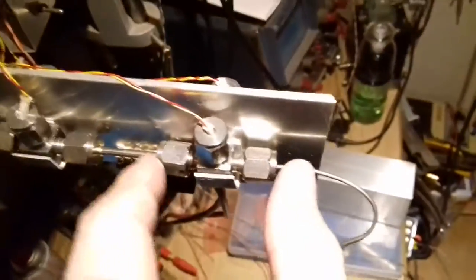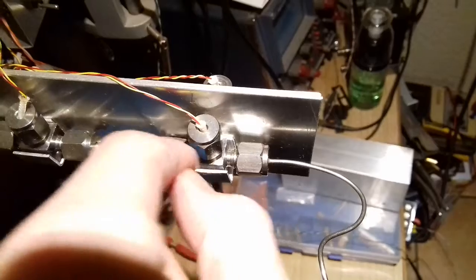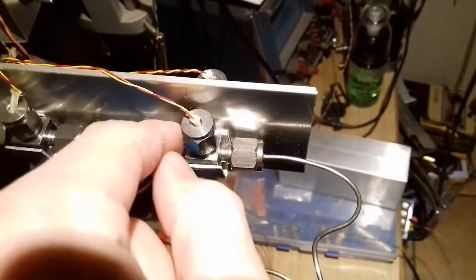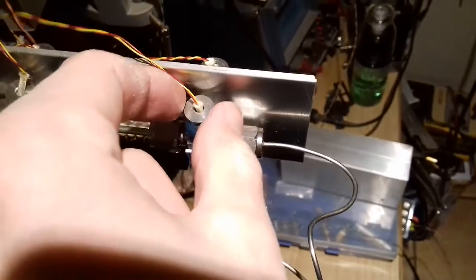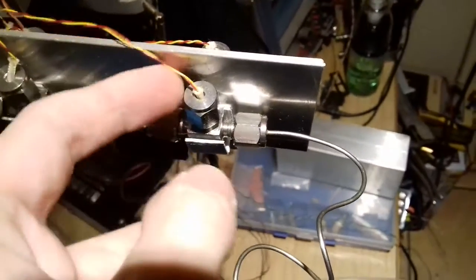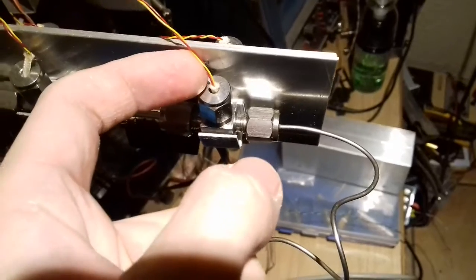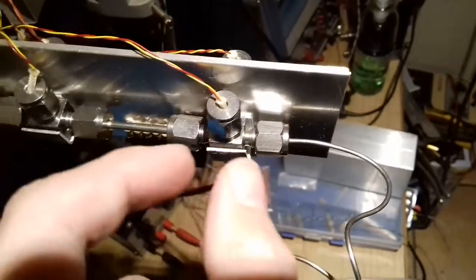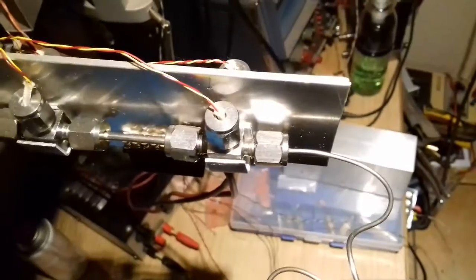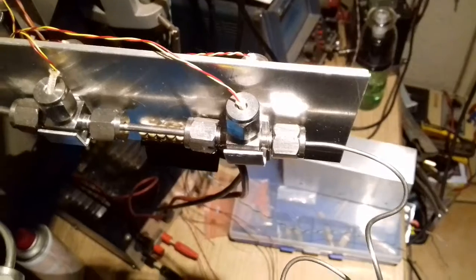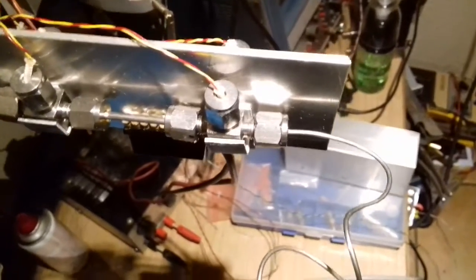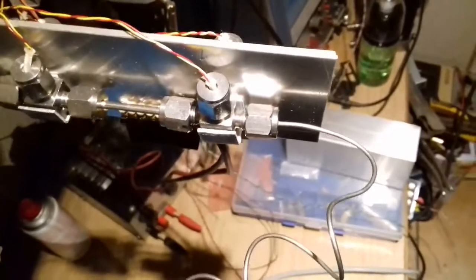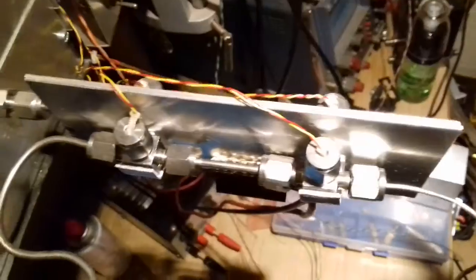And this is just four elements of these T-fittings. And in the third port here, the side port, a little instrument light bulb, which is also one-eighth inch in diameter that's been ground open, sitting as an element. And that's then heated. And then it reacts to the thermal conductivity difference between the carrier and the outlet of the detector.